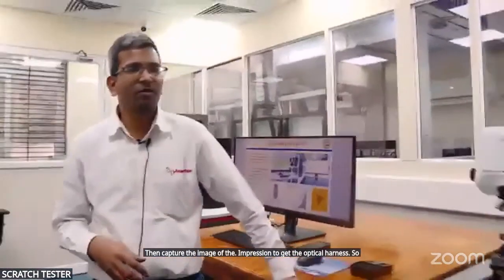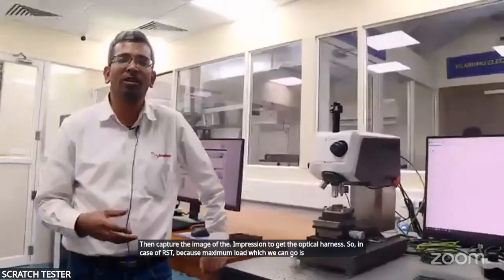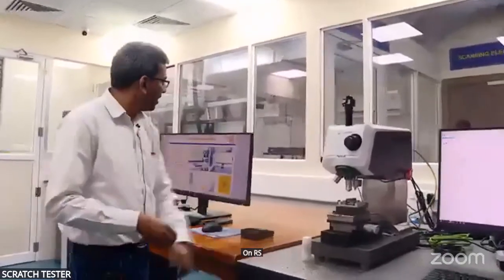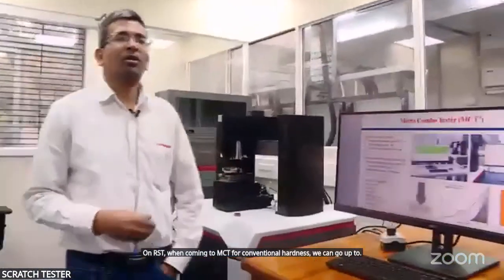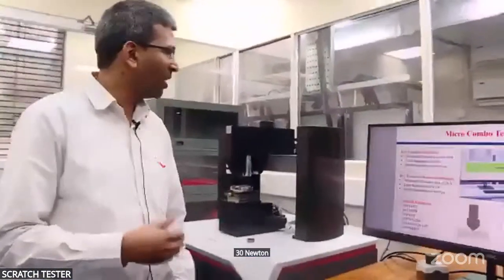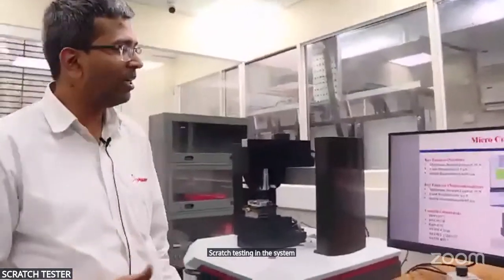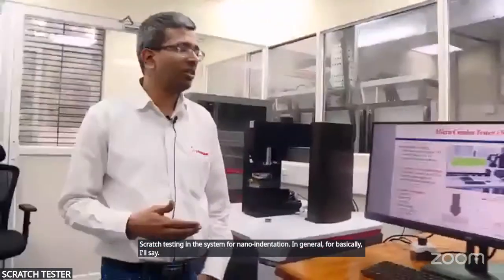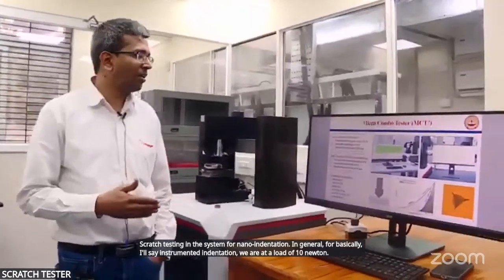In case of RST, the maximum load we can go is 200 Newton, so that is the maximum load for conventional hardness on RST. When coming to MCT, for conventional hardness we can go up to 30 Newton, because that's the maximum allowed load for scratch testing in the system. For nano indentation, in general for instrumented indentation, we are at a load of 10 Newton, which we are limiting ourselves to.